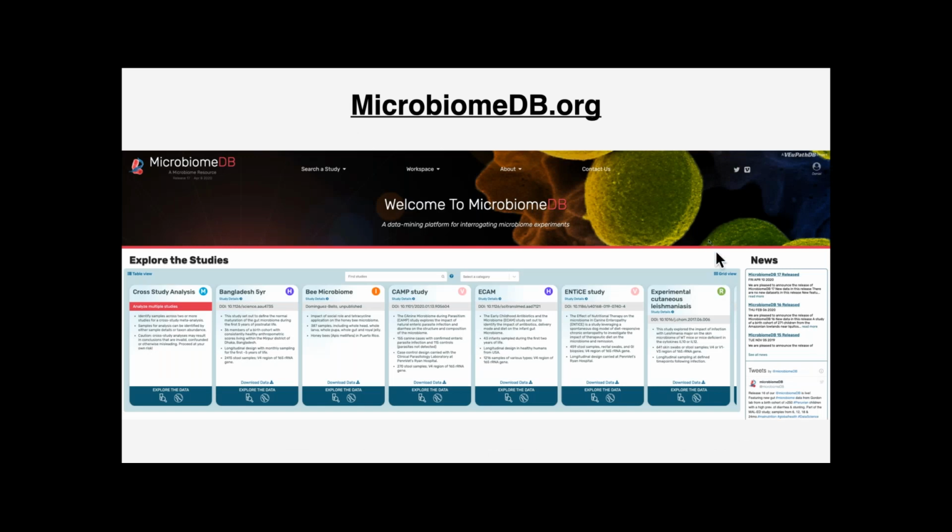Okay, so before we actually go to the website, I want to highlight with the landing page picture up here where we're going to be navigating to and why. The first thing I'll point out is that virtually all aspects of the site are accessible without the need to have an account. That said, having a user account does give you some flexibility and features that you can't get without an account. Most notably, it allows you to save and share your searches, which is really fantastic. And now that we have our own private workspace set up, it also allows you to access your own workspace and upload your own data.